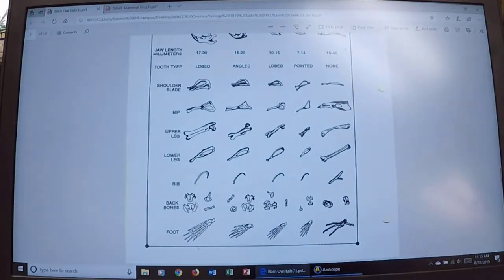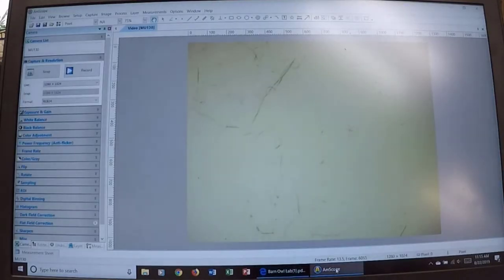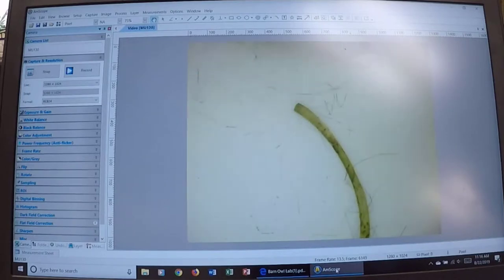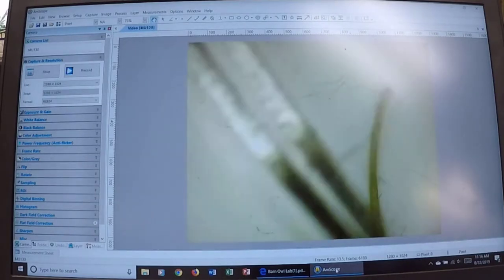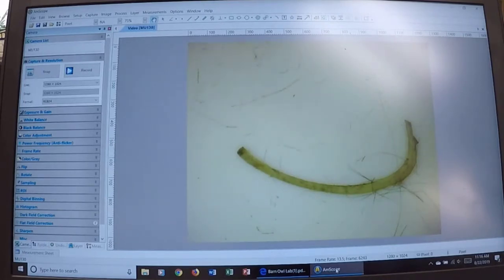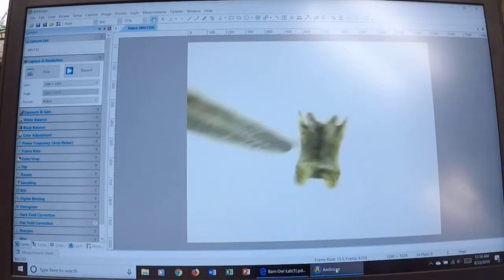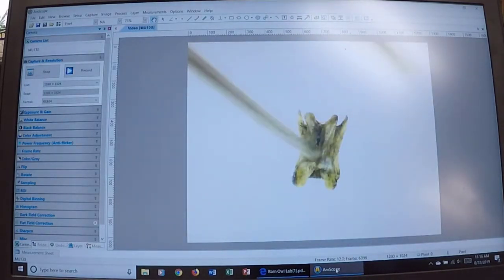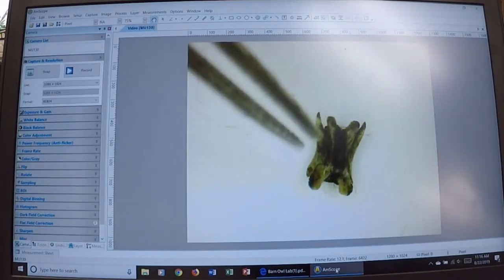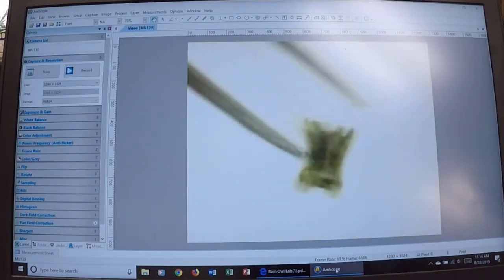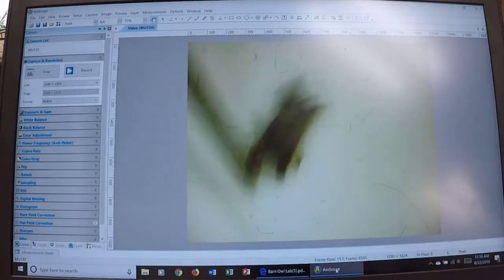Some rib bones, back bones, and then the foot. The rib bone is really simple — most of you have consumed ribs or at least seen them before. You'll see lots of these rib bones. The backbone, or part of the vertebral column — sometimes you'll have a tail with a bunch of vertebral segments, other times just simple backbone segments.